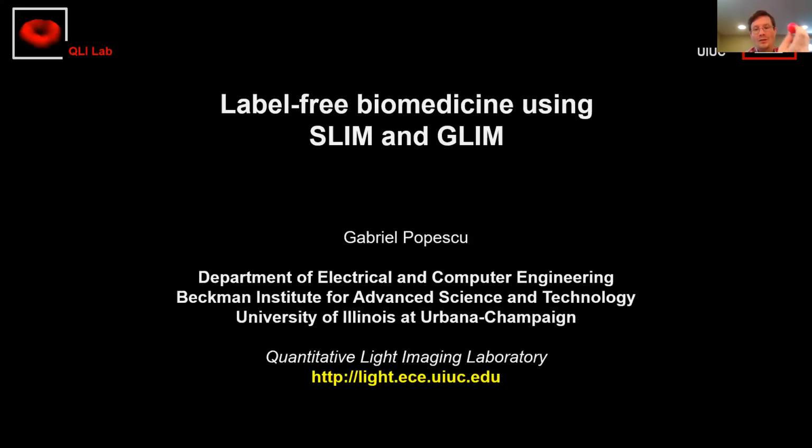So one of the applications that I see these microscopy techniques being able to do very effectively, and this is my question for you, Dr. Popescu, did I pronounce that correctly? Yeah. Okay. Because I understood from Catalin that you can do very precise measurements of the morphology, including all the dimensions, and because you have the refractive index data, if you know what this material is, you can estimate the mass of this. Let's say that this was a sphere that had dimensions of a micron or nanometers.